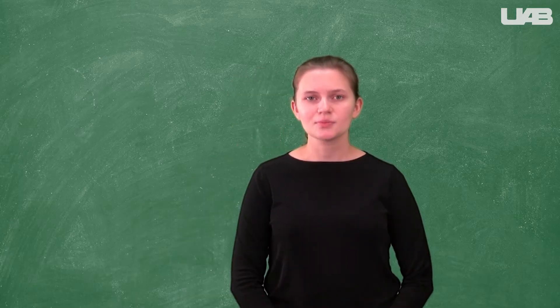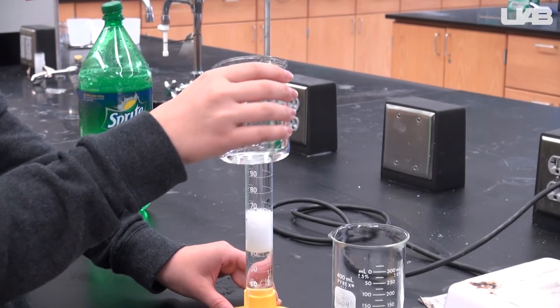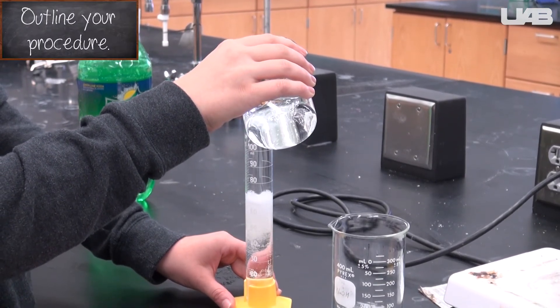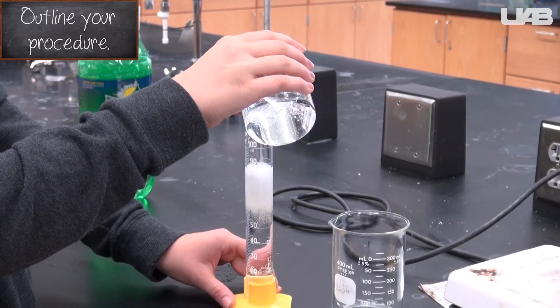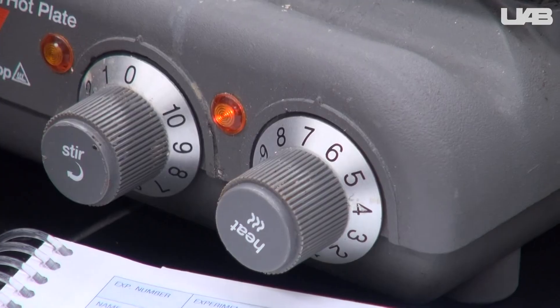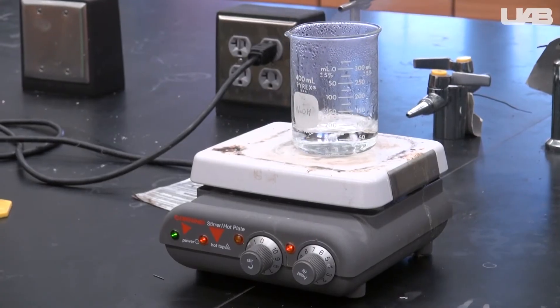To find out how much acid is present in soda, you will follow the exact same procedure. Before you start your titration, you will need to get rid of the carbonation. Accurately measure out about 100 milliliters of soda, then heat it in a beaker for about 15 minutes. Add water to bring the volume back to the starting volume.